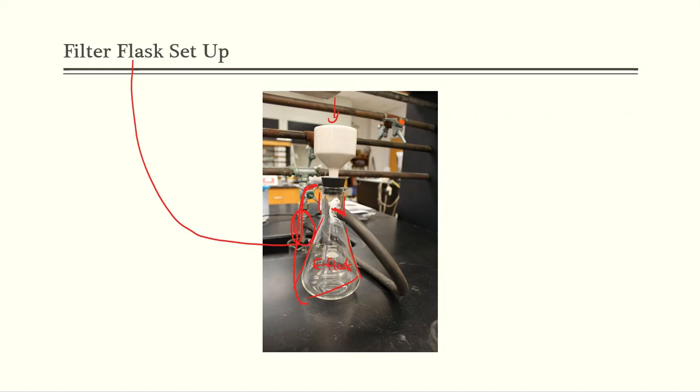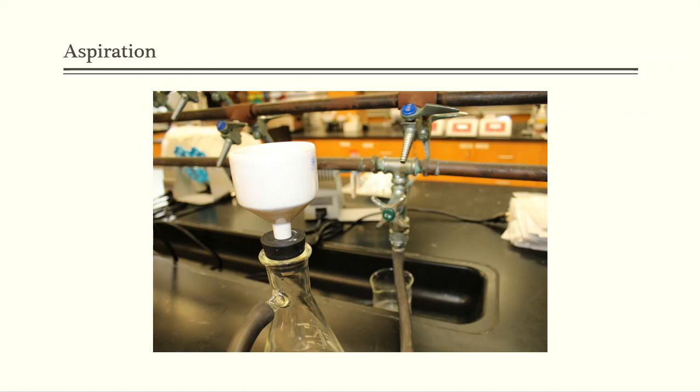And the aspirator really refers to this piece back here. It's aspirating my sample, so it's pulling water through. That water's creating suction. That suction is pulling air through the funnel area, and it allows me to drain off that liquid even faster. So here's just a different view of that setup.